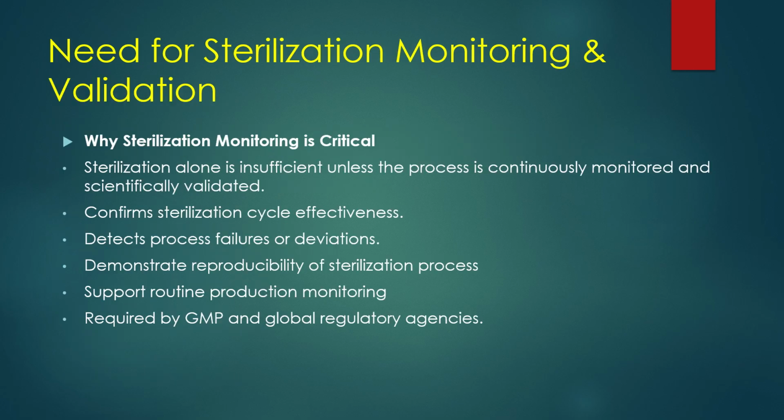Let's understand the need for sterilization monitoring and validation. Sterilization alone is not sufficient unless the process is continuously monitored and scientifically validated to ensure consistent performance. Sterilization monitoring confirms the effectiveness of each sterilization cycle and helps detect any process failure or deviations that may compromise product sterility.